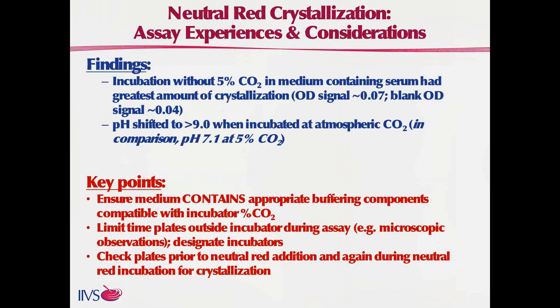Now what we found through this R&D experiment is that we actually were able to induce crystallization. The medium containing serum and incubated outside of the 5% CO2 had the greatest amount of crystallization, and we also noticed that this medium also had the greatest shift in pH when the medium was incubated outside of the 5% CO2 incubator. So the key takeaway points here are that when you are running the assay, you want to make sure that the medium that you're using is supplemented with the appropriate buffers and incubated under the appropriate conditions. You should also limit the amount of time that the plates are outside the incubator, especially if you're working with a large number of plates.